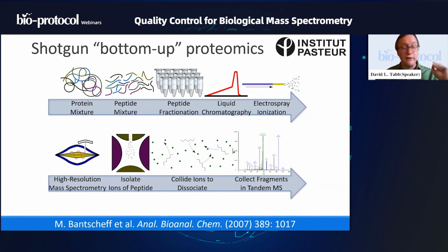So a peptide that's just covered in L's and V's and I's is going to stick to the column a lot more aggressively than will something that's much more acidic or basic in nature, something that isn't so hydrophobic, in short. So the liquid chromatography is already representing the second stage of separation. We've got some sort of fractionation we've used up front, and now we're using reverse phase separation on the peptides in a particular fraction. As the peptides elute from the column, they are subjected to electrospray ionization.